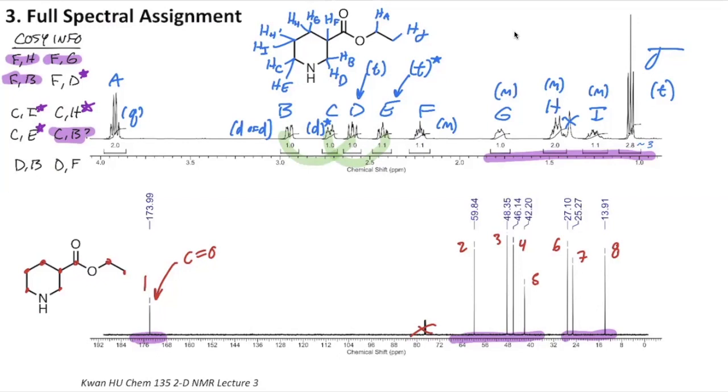So F to H, F to G, and F to B didn't change. F to D, though, now is here. That checks out. So that seems better.